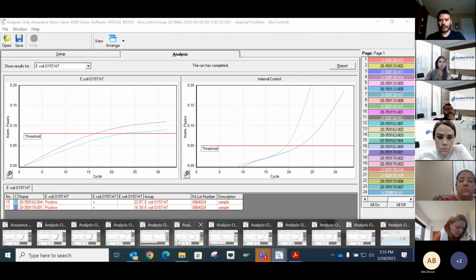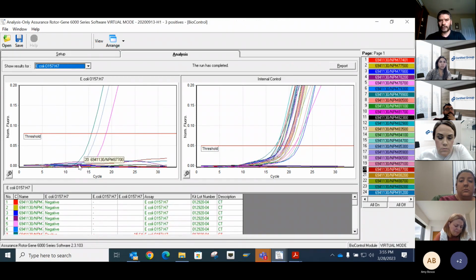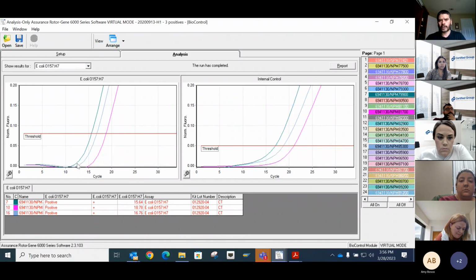When we look at truly valid positives, you can see these started their upward movement, I don't know, was that 12 cycles? And then this one, that's the green, crosses within 3 cycles. Generally, if you notice where they start their initial increase in fluorescence, a significant portion will cross within 6 cycles. And then some will take maybe 7, probably at most 8.